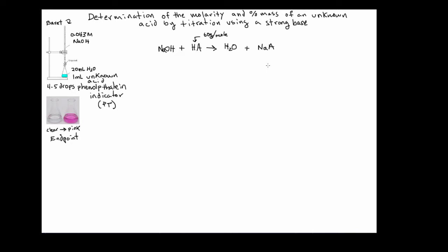Now, I'm going to basically kill two birds with one stone in this video, because what we're going to do is learn how to determine the molarity of an unknown acid, and then we're also going to see how the titration is used to do the percent mass of the same acid in a given solution, rather than producing two videos that involve essentially the same exact titration.